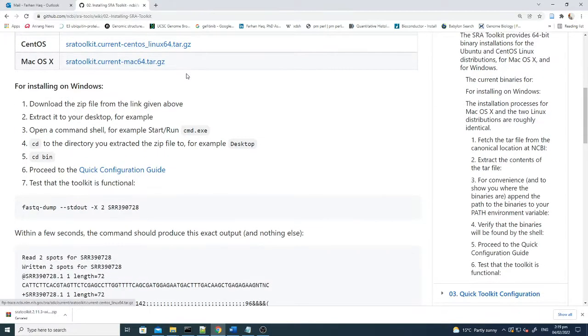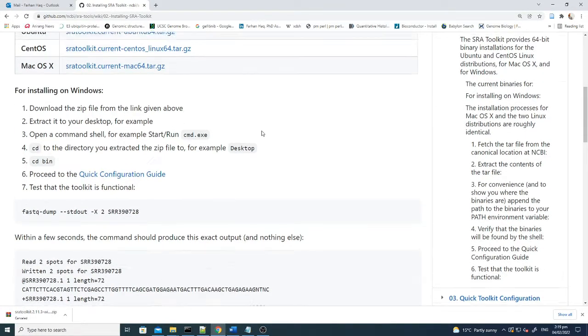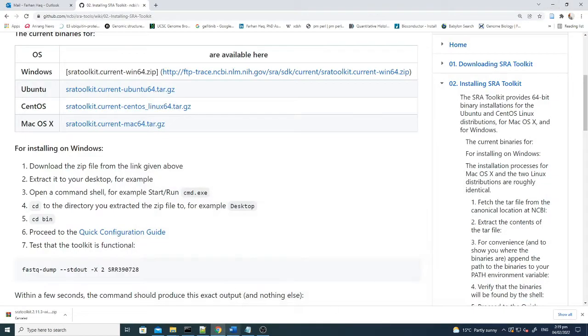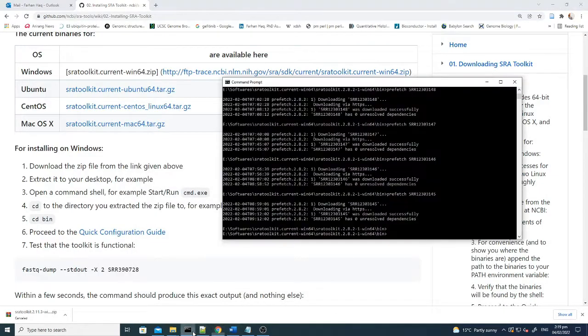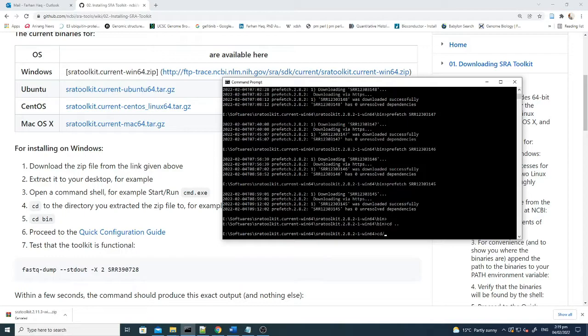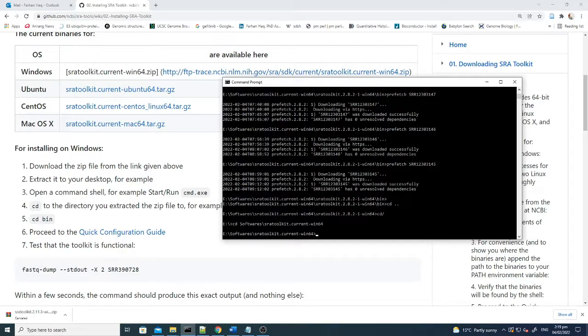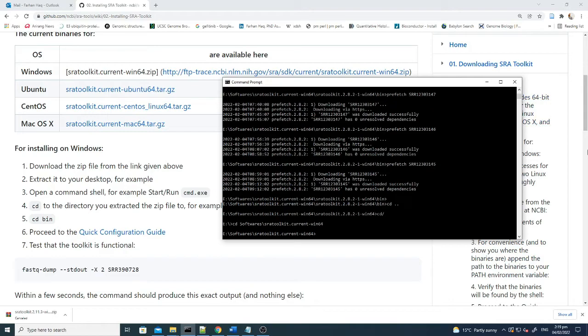After downloading, the first step you need to do is check whether it's working. You have to open the command prompt and run a command to check it. For example, here in the command prompt, I went to the software folder where the SRA toolkit is installed.